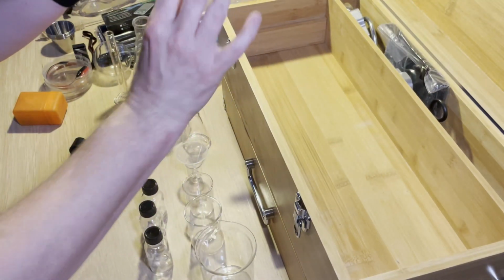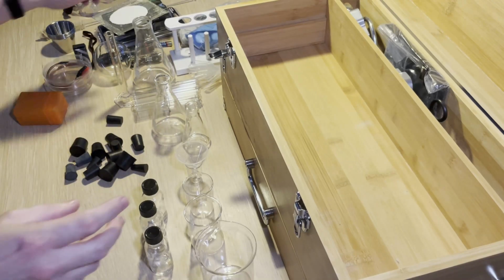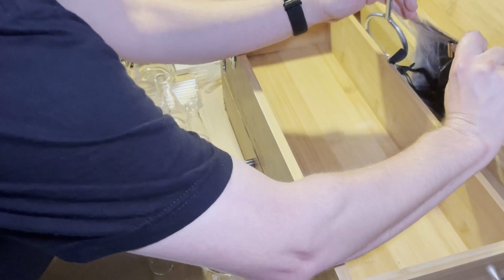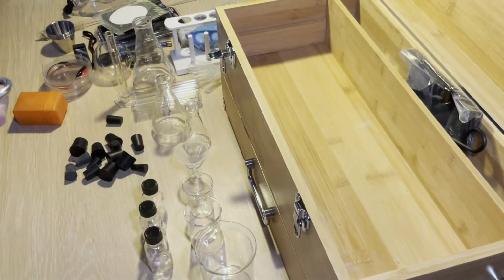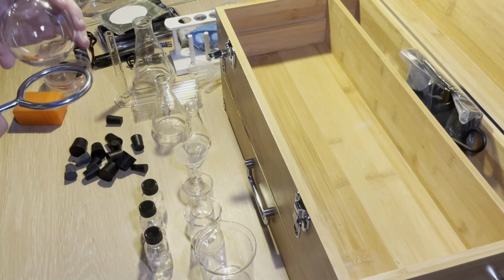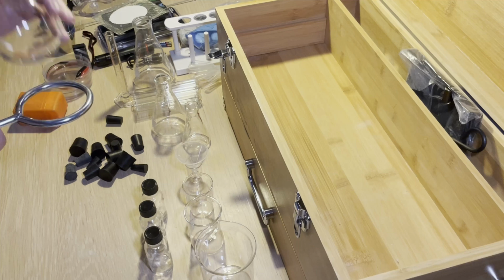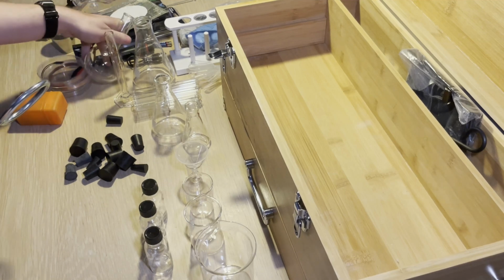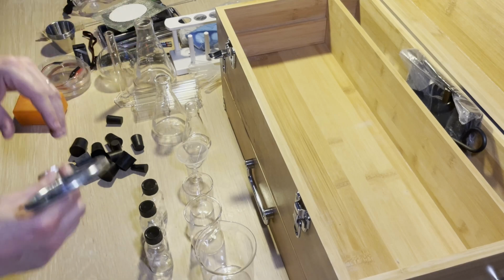We have a beautiful protective thing to boil stuff on. Then we have the stand and stuff. So here you can put your boiling flask. You can put it in here. You can also put it in a different way, as you could see in previous videos.